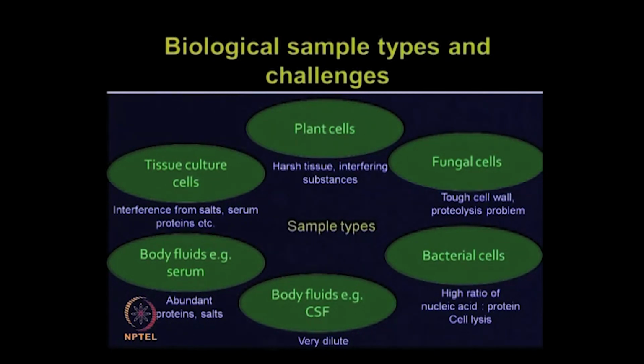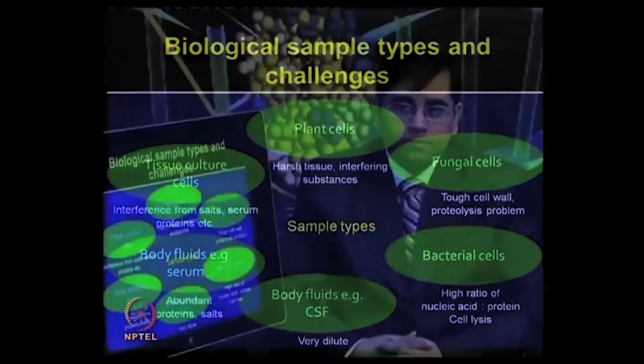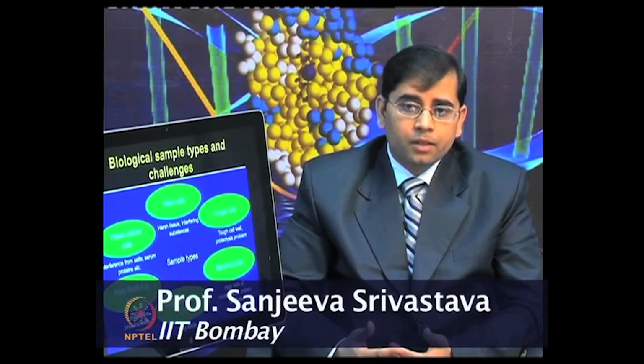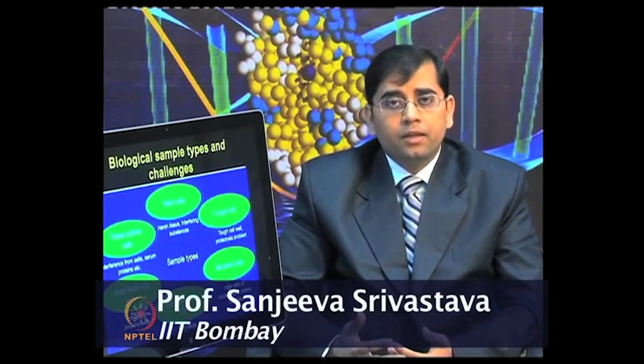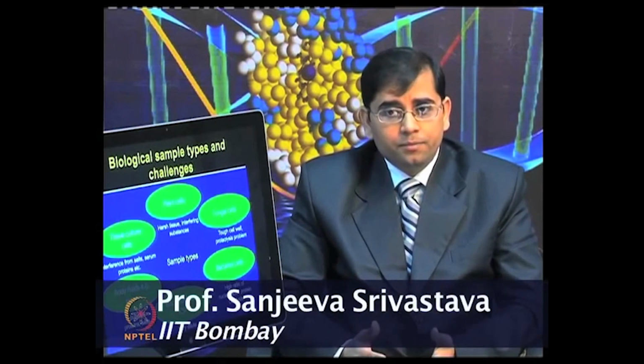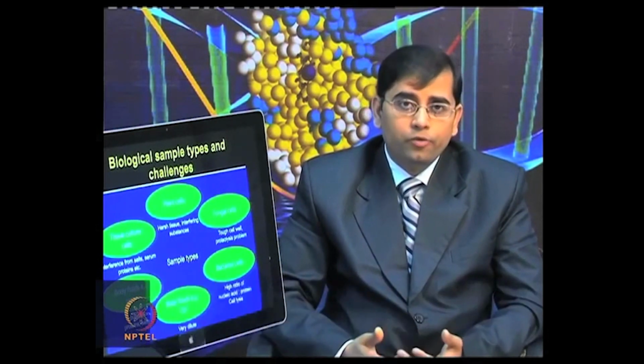Fungal cells such as yeast or other types of fungus, if you are interested in performing proteomic applications on these samples, you need to break open the very tough cells. So, the proteolysis problem also occurs in these samples. Bacterial cells have a high ratio of nucleic acid to protein and cell lysis is also very tedious.